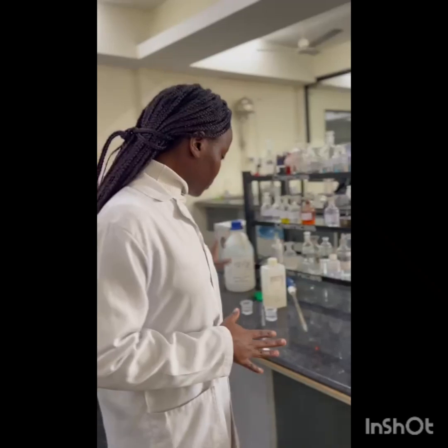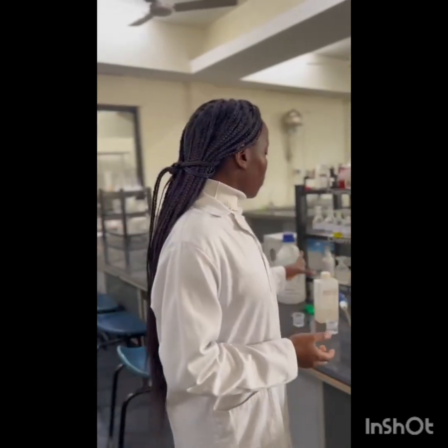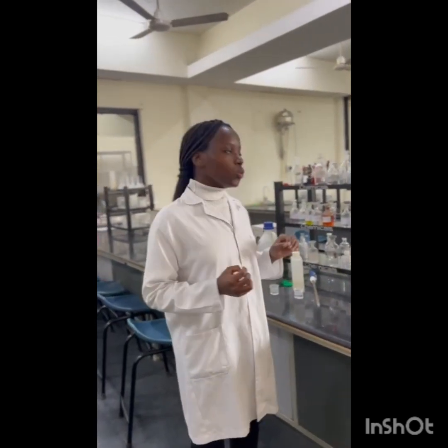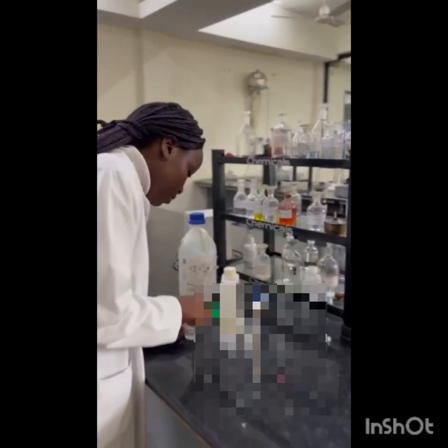Before decalcifying, you have to make sure that everything is around where you need it. We need to make 5% formic acid, and I've already made it. You need 5 ml formic acid in 95 ml distilled water. So I've already made my 5%. It's in here. Then you take the tissue and place it in the formic acid. It has to be submerged in the formic acid.